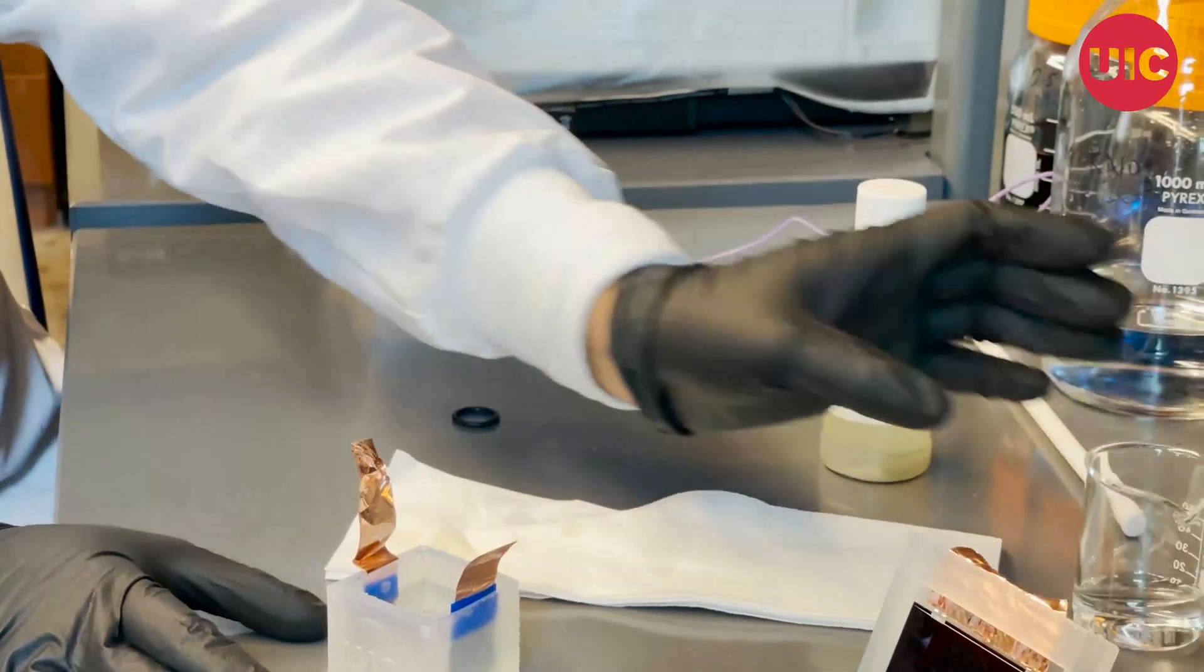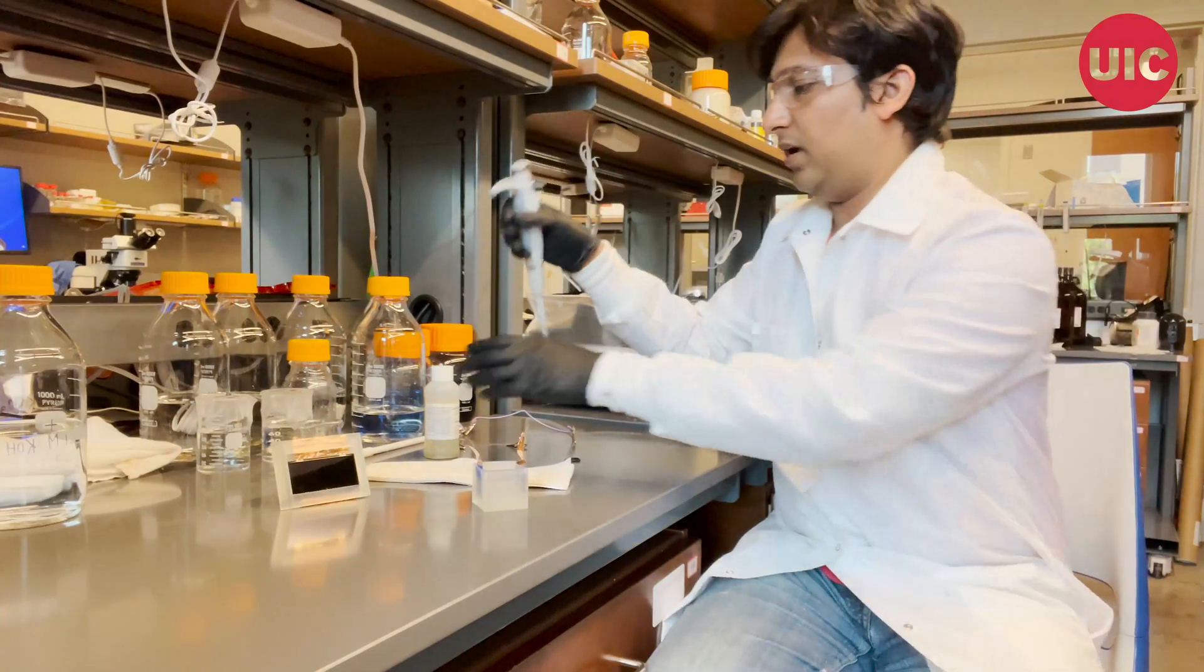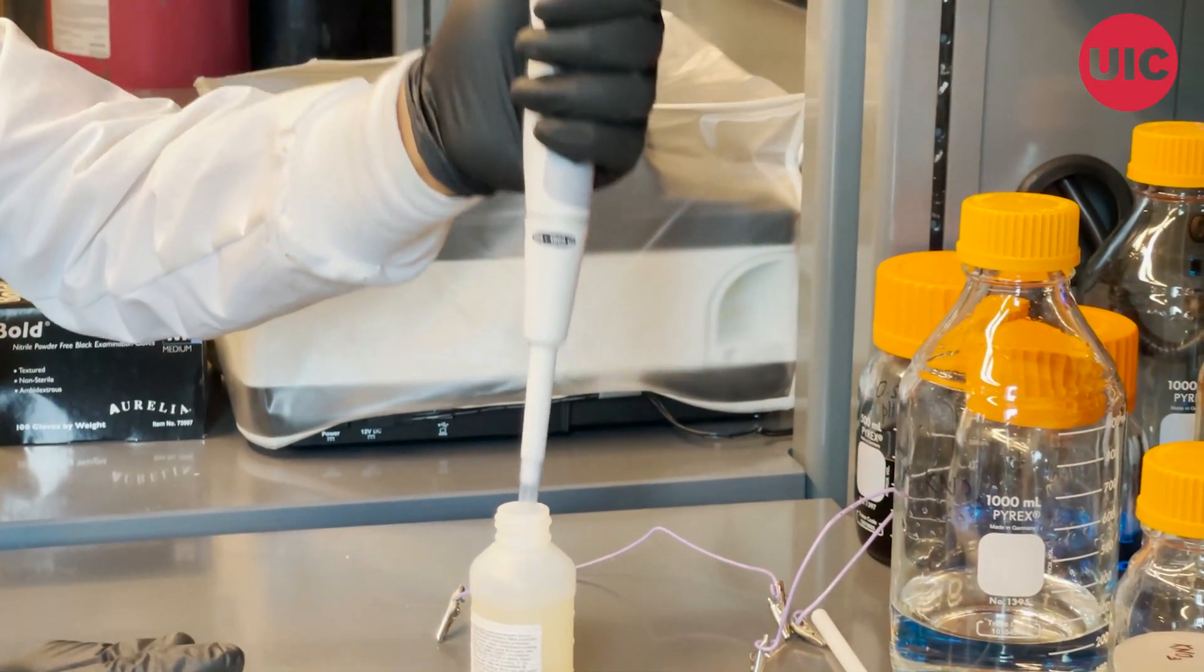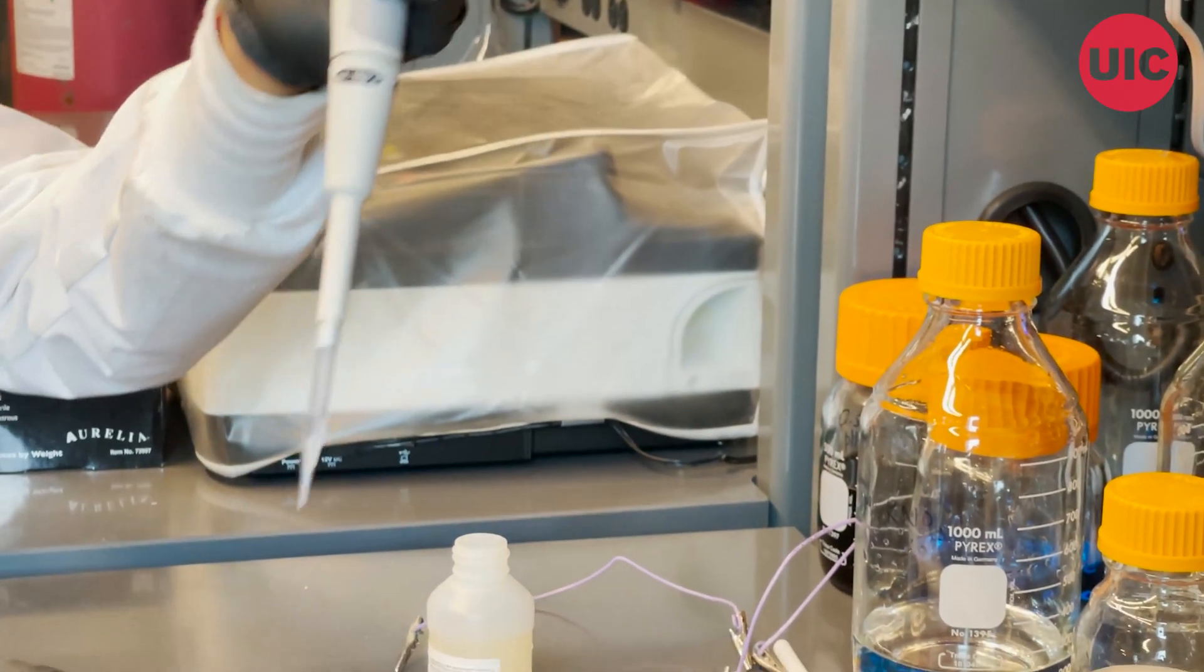Once the electrolyte is filled, we'll add 500 microliters of Nessler's reagent, which will help us in detecting the presence of ammonia.